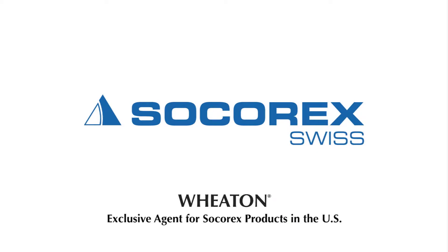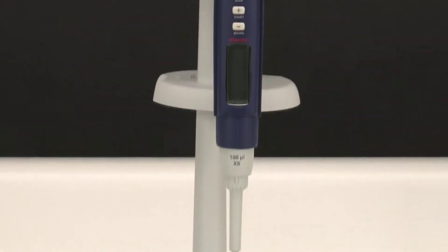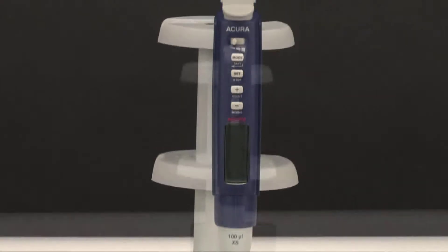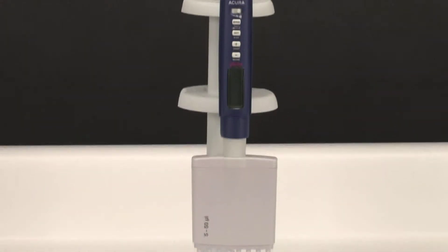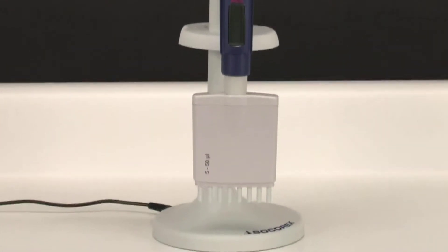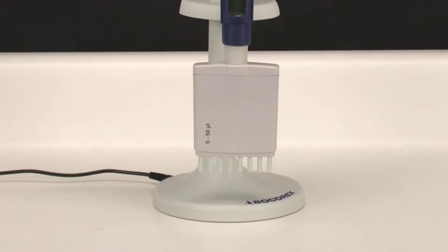Socorex Acura Electro Pipettes. The Acura Electro series of microprocessor controlled pipettes from Socorex offers a wide selection of high precision instruments to meet the exacting demands of almost any liquid handling application.